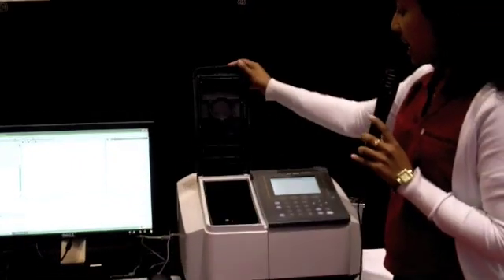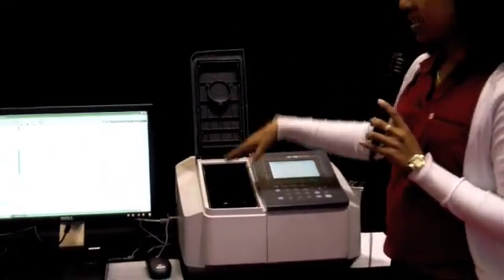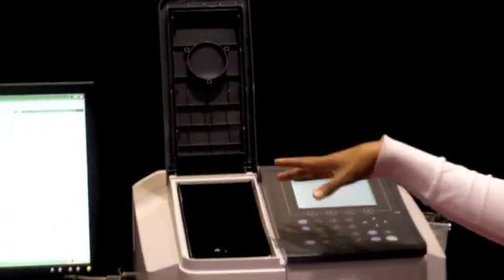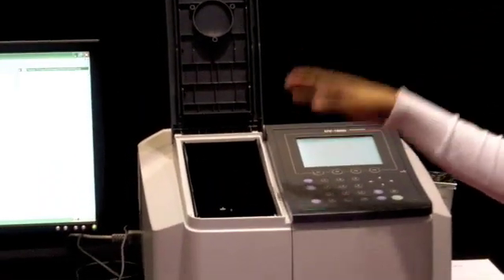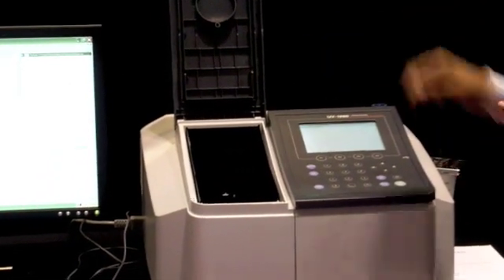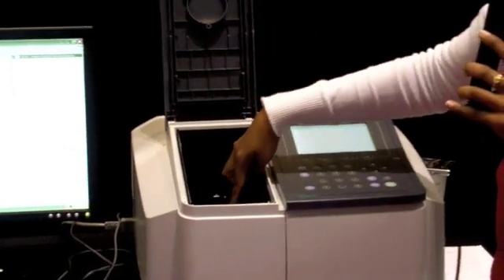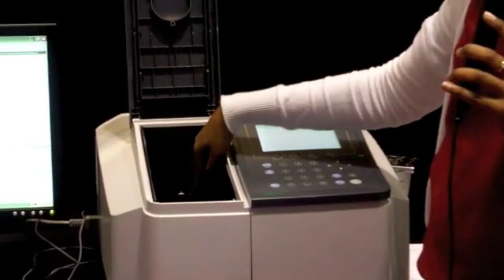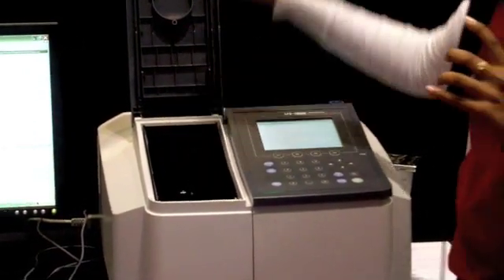It is a standard double beam instrument with true double beams, so it's not a split beam instrument. You've got an area for sample and an area for reference.